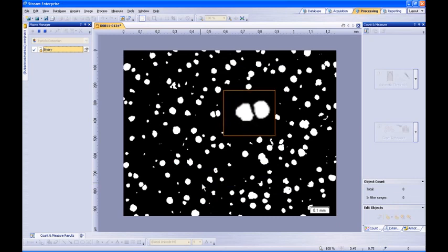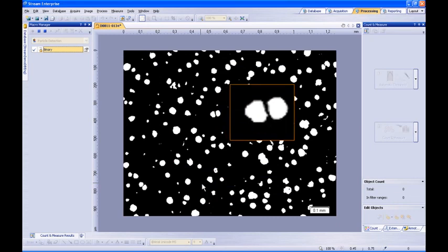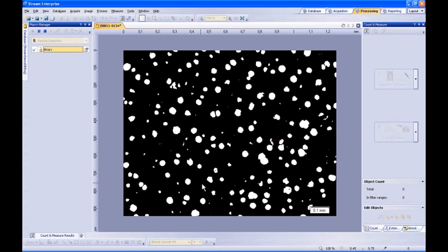Now that the particles which have been previously touching have been automatically separated, we can continue on to the next step of the particle detection, which is to set our grayscale thresholds.